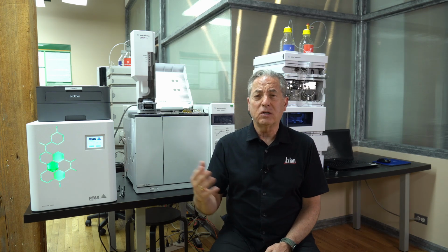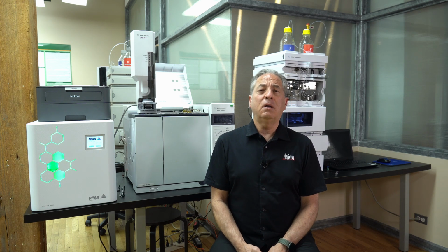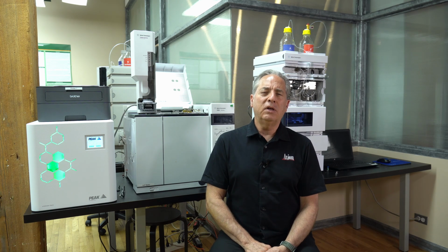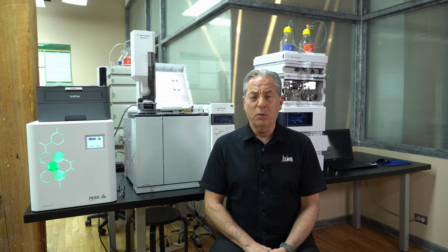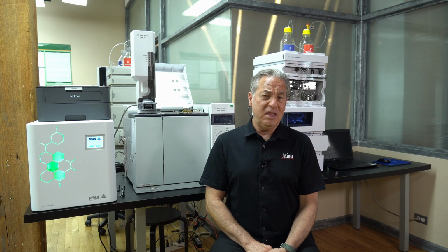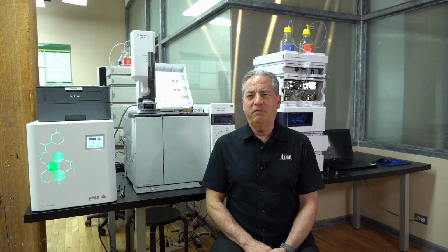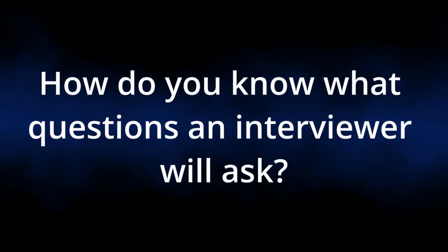So if your organization is ISO 9001, it means that the laboratory itself is operating under ISO conditions. So you will have validated methods, and you will have method SOPs that you will have to follow. Also in the environmental world. So that is an explanation of validation.